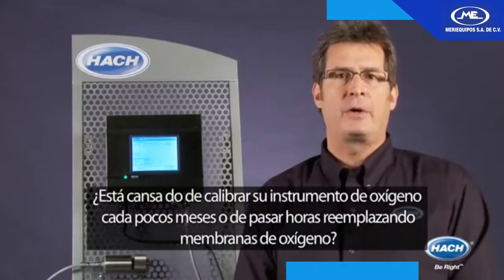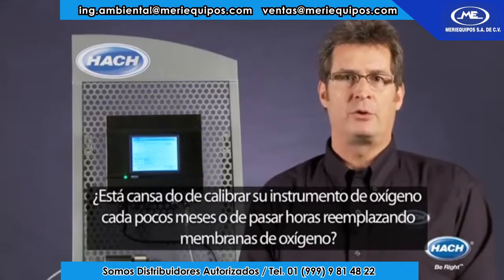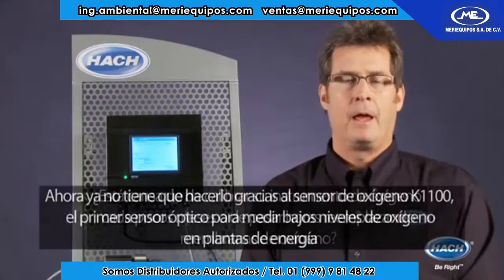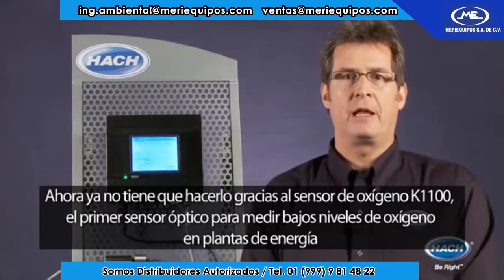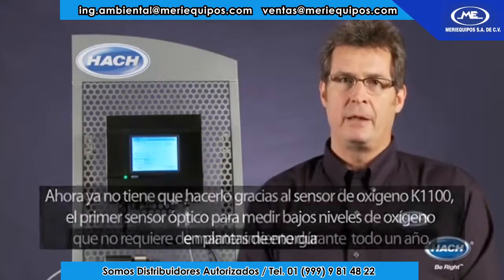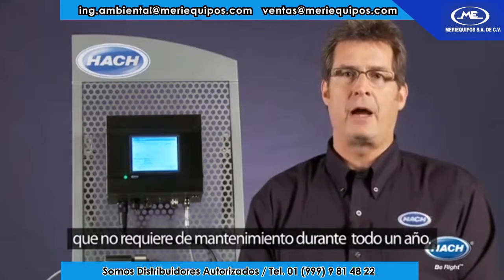Are you tired of calibrating your oxygen instrument every few months or spending hours on sensor maintenance and replacing membranes? Now you don't have to, because the K1100 is the first optical sensor to measure dissolved oxygen down to one PPB that requires no maintenance for an entire year.